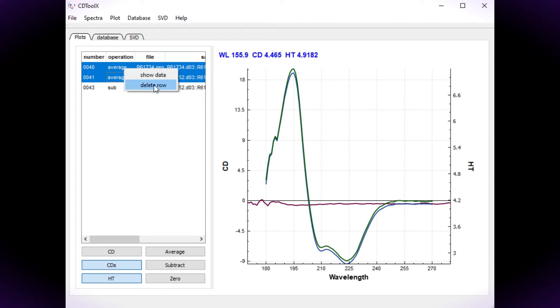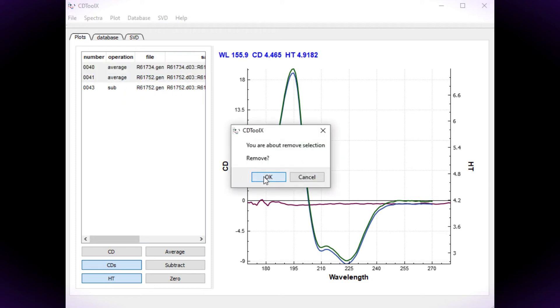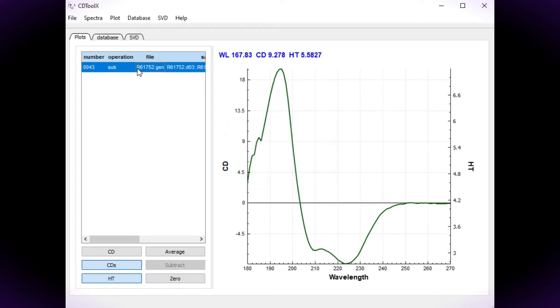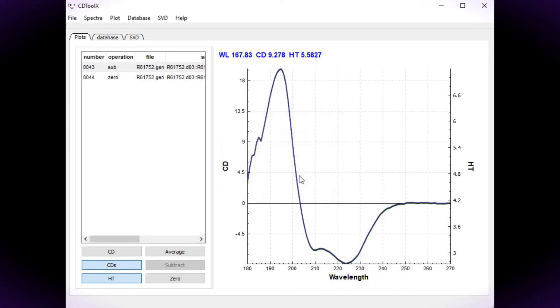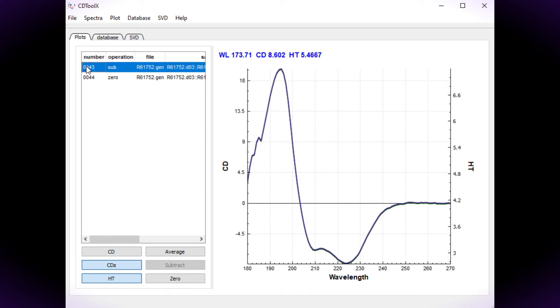If required the data can be zeroed at high wavelengths. Select the data, press zero. The default wavelength range for zeroing is 265 to 270 nanometers. You can alter this if you wish. You can now save the spectrum.